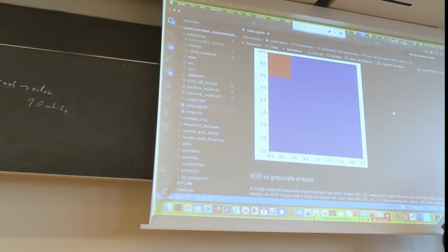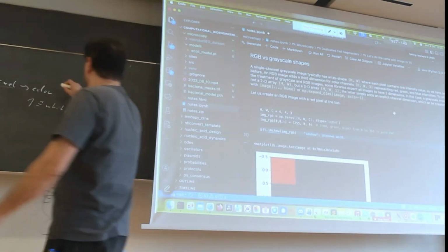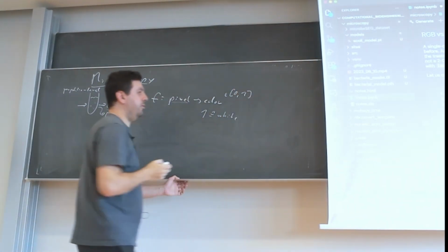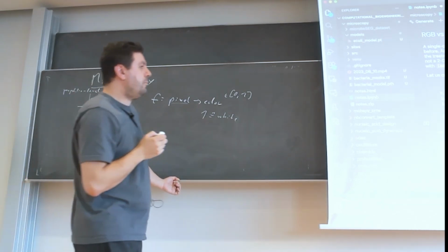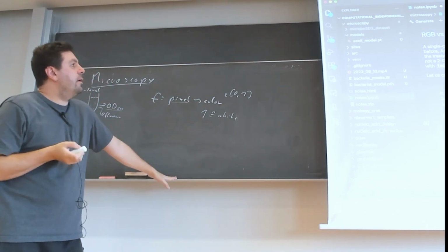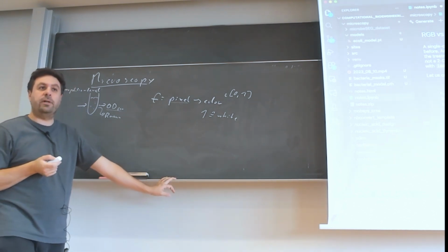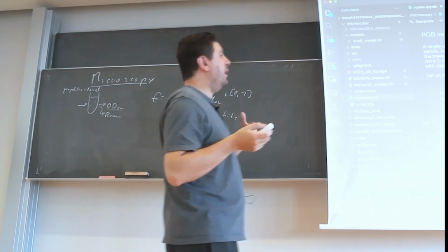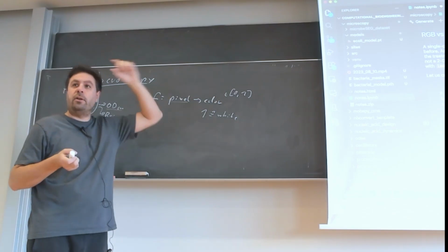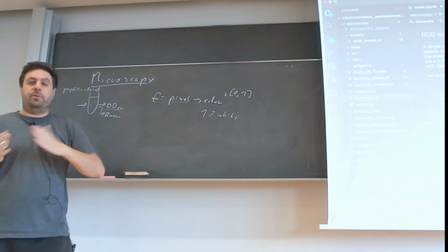So that was for the simplest images, where our color is just a number. In our case, it was a number between 0 and 1, a float. Or it could have been also an integer. We didn't make use of the fact that it's a float here. But you can have more complex colors. This allows grayscale images to be represented, even if they are not shown in grayscale but in different color maps, but they have only a one-dimensional color, which is a grayscale image.